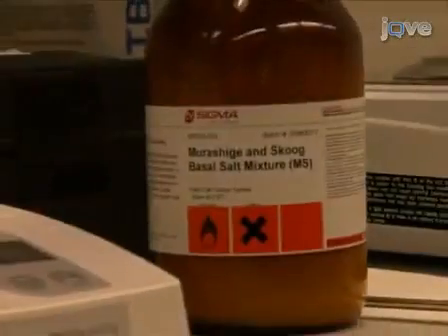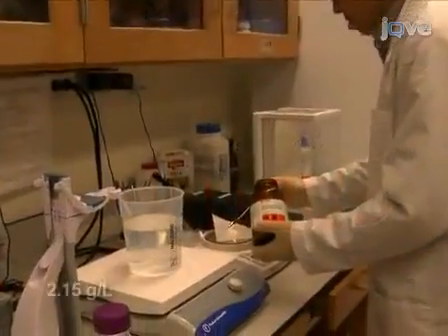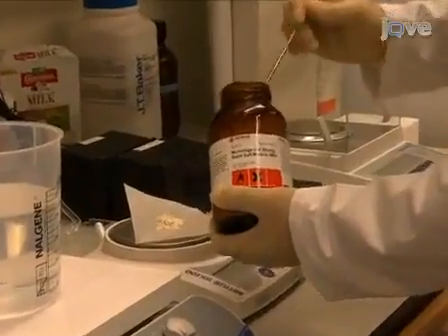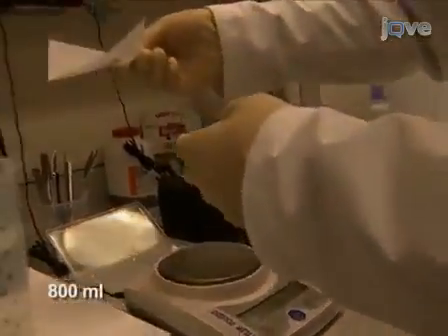We start the procedure by preparing 0.5 times MS plates supplemented with 1% sucrose and 0.7% agar. For one liter of medium, weigh out 2.15 grams of MS powder and add it into 800 milliliters of water in a 1.5 liter autoclavable bottle with a stir bar.